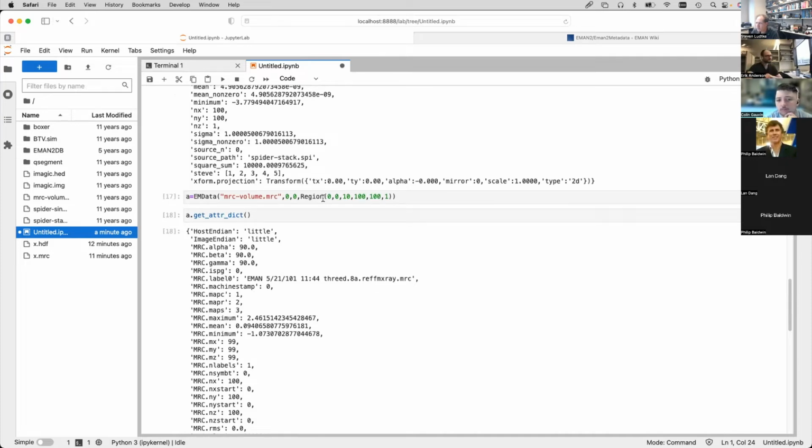The same option is available for writing images. So if you have a giant MRC volume on disk and you want to write just something to the middle of that image without perturbing the rest of it, you can read a slice out from the middle and you can write back to that same slice without having to read the entire volume into memory.